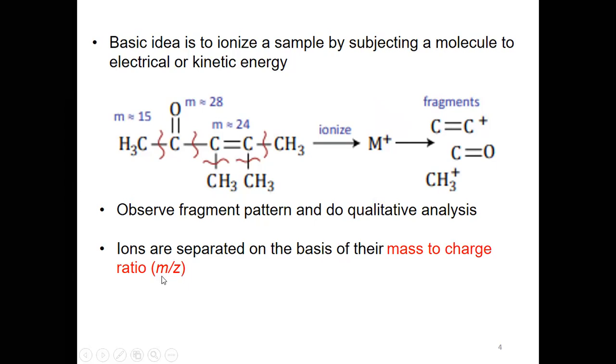And keep in mind, let's say if it is neon, or whatever the element, X2+, and the mass of X is, let's say, 20. Mass is 20, X2+. If the ion is X2+, then the mass to charge ratio will be: M will be 20, charge is 2, then it should be 10, right?